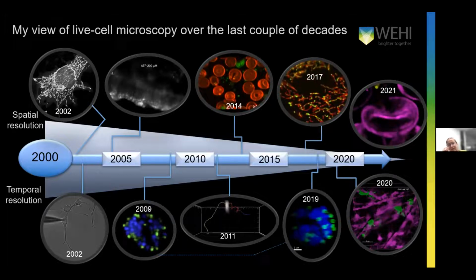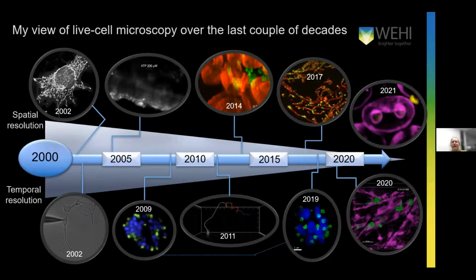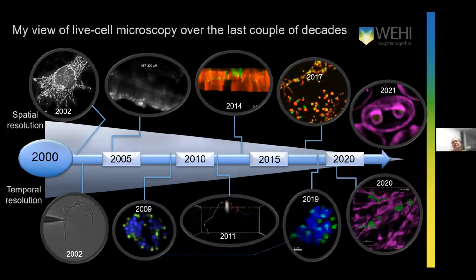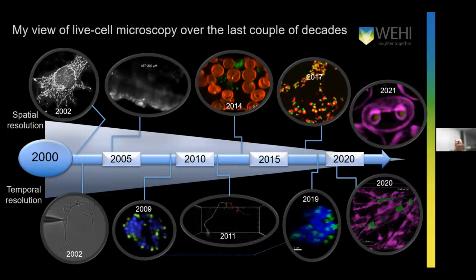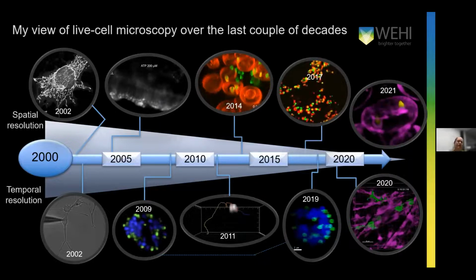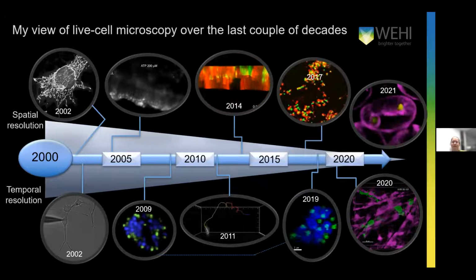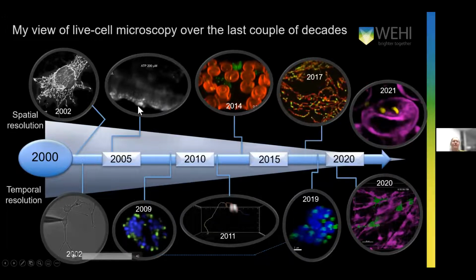The interesting thing was that back in those days, we even had a RAID array or a little mini server inside the imaging facility, and we were using Huygens deconvolution software. We would take a simple Z stack on a confocal, we were using the Zeiss LSM 510 at the time, and then take that file and put it into Huygens deconvolution software in the afternoon and come back the next day to find that it had finished deconvolving. So it's certainly not like the speed at which we can do things today, but this is really just to show you how things have evolved.